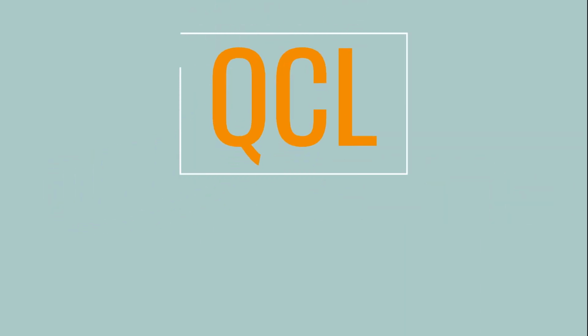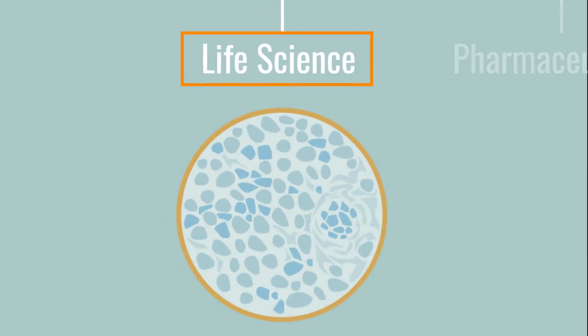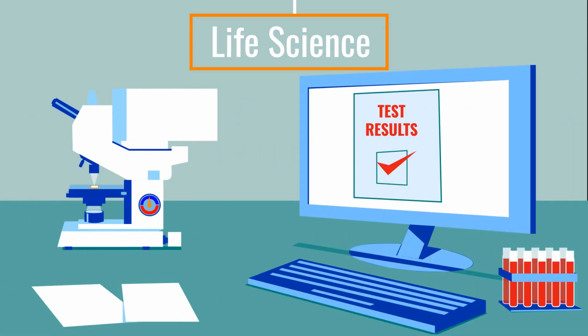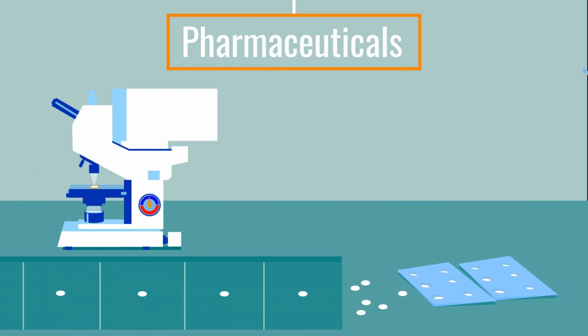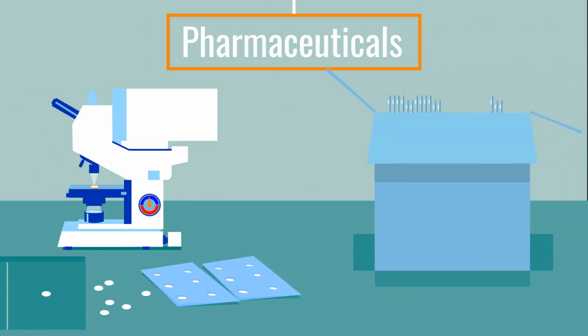As QCL technology rapidly emerges from infancy, we see new applications rising too. In life science, IR microscopy is already being applied for label-free biotissue analysis. However, QCL would not only improve performance, it could also pave the way towards future, more efficient diagnostic techniques. Pharmaceutical development can also benefit enormously, as QCL's high throughput is a key advantage throughout the drug development process, from initial research to end-stage quality control.